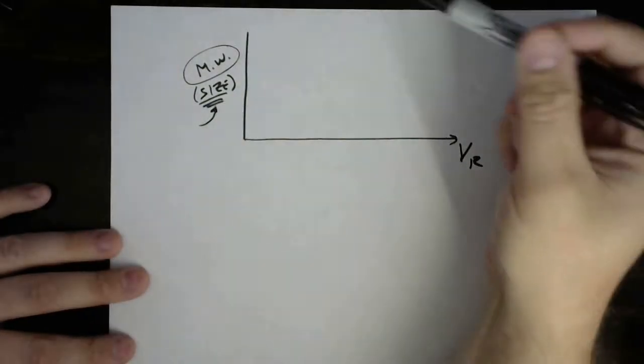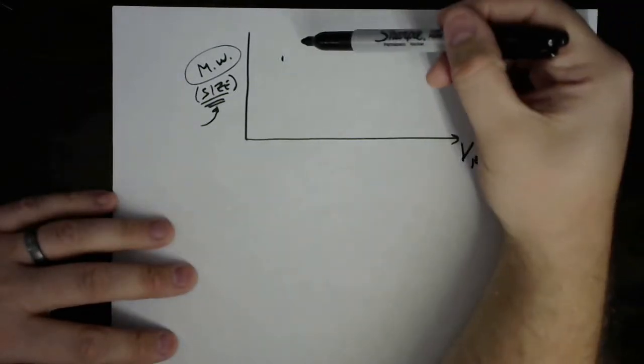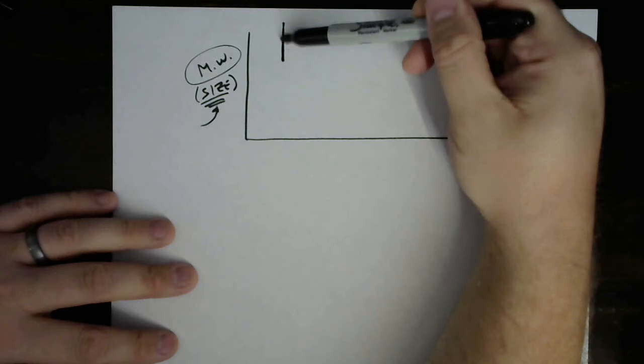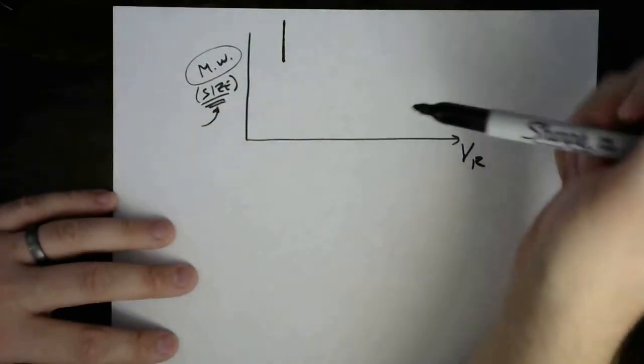And what we said is there's some large molecular weight above which we're going to get no resolution. Everything's going to have the same retention volume. It's going to come out as the same peak, right? So it's all of this right here. All these molecular weights come out at the same retention volume.